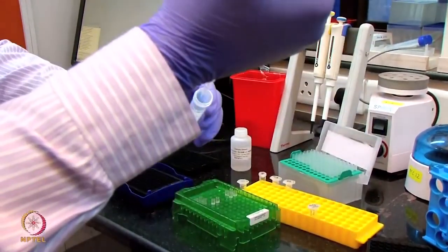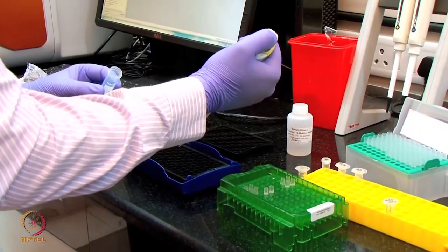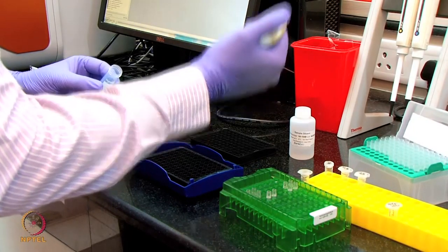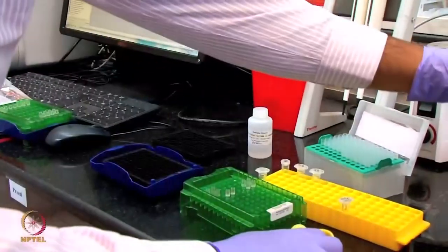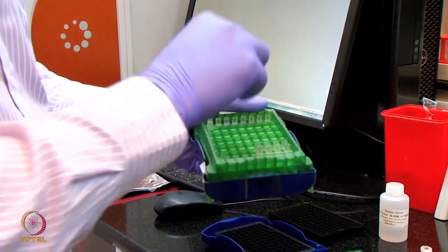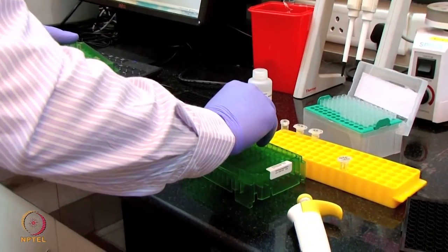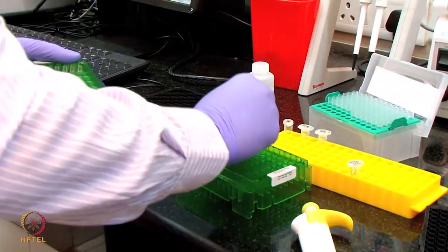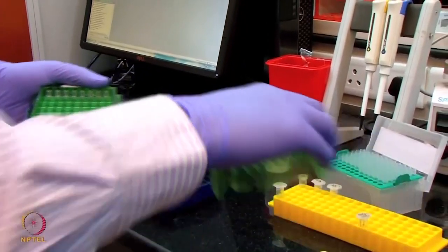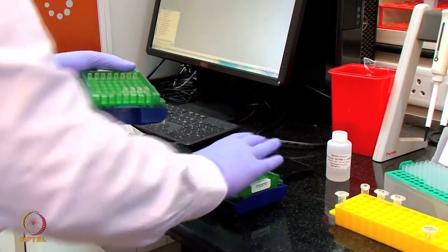What I am doing is, I am adding 200 microliter of 1x PBS into the 96 well plate. Next step, I'm taking the biosensors, which are the streptavidin sensors. These are the sensors, they look like this. I'm going to put them onto the sensor tray. This is the sensor holder tray. I am putting the sensors like this. Now I am keeping this sensor tray for hydration for 10 minutes. So now I will set aside these sensors for 10 minutes.